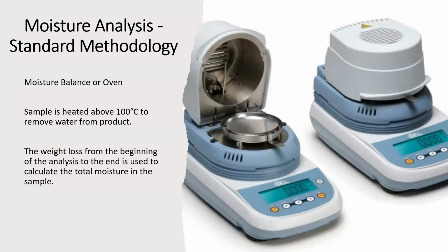With a moisture balance, the sample is heated in a very tiny oven, and the balance will record the weight change over time. Once the weight stabilizes and is not changing anymore, the sample is considered to be dry, and the final weight of the sample is recorded.